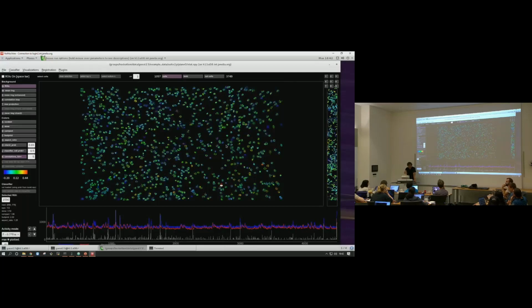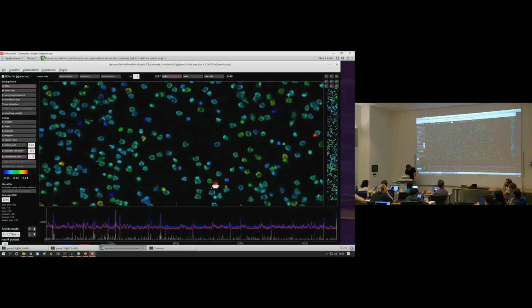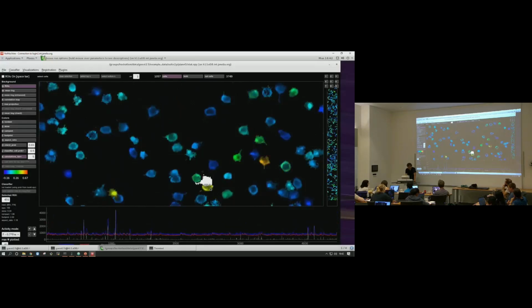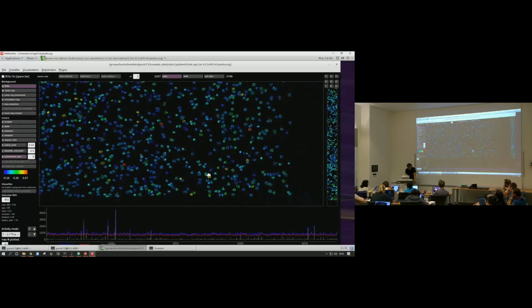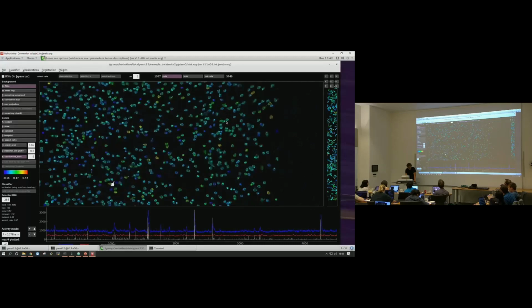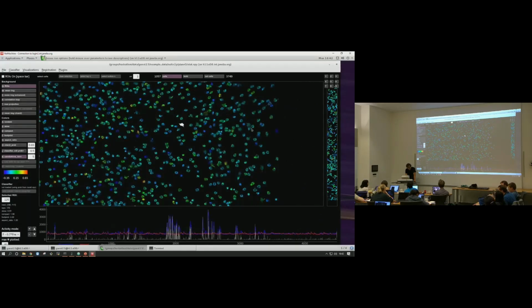Now the correlations have updated, and you can see there's no more spatial structure at all. There's a high correlation here with the cell that's basically overlapping. So we can be pretty sure it's due to the overlap that the correlations are so high. And we can click on other cells and play this game to ask whether we can find any cells that are correlated with their neighbors or not.